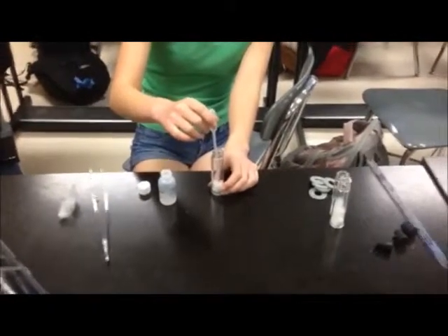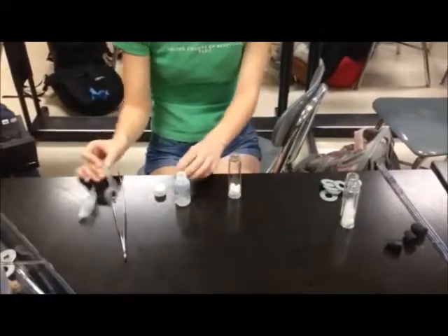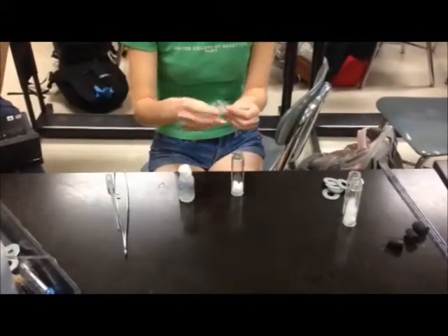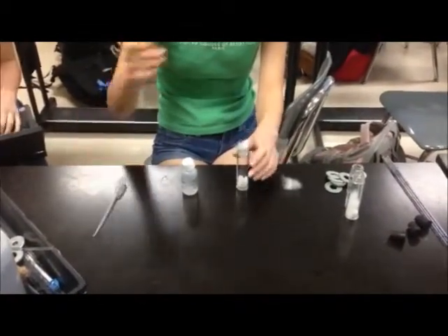We put a small amount of cotton in the bottom of the respirometer and add 10 drops of potassium hydroxide. Then we place a small amount of non-absorbent polyfill to serve as a buffer between the potassium hydroxide and the peas in the respirometer.